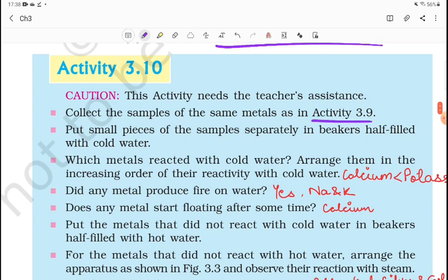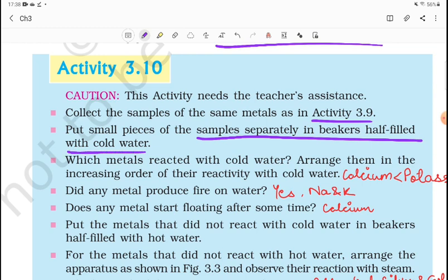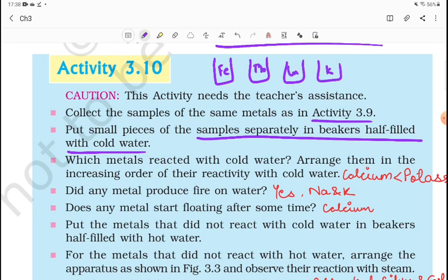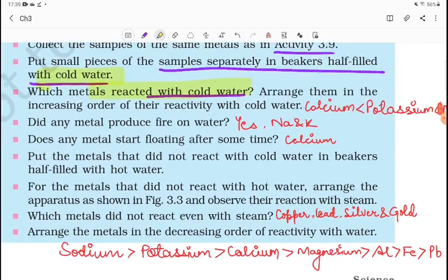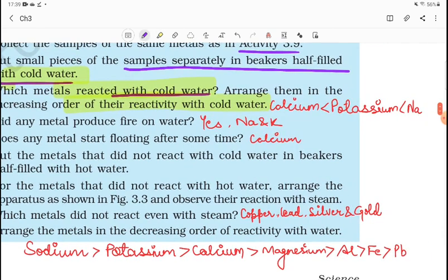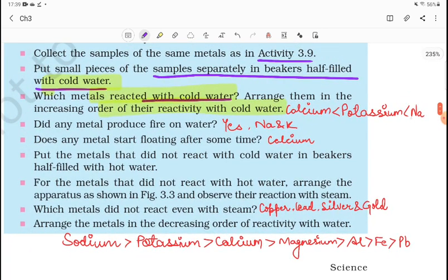In this activity, we have metals like sodium, potassium, calcium, iron, copper, silver — all these metals. We put small pieces of each sample separately in beakers half-filled with cold water. So all the metals — calcium, potassium, magnesium, aluminum, iron, lead — are placed in beakers. Now, which metals react with cold water? You can arrange them in increasing order of their reactivity with cold water.